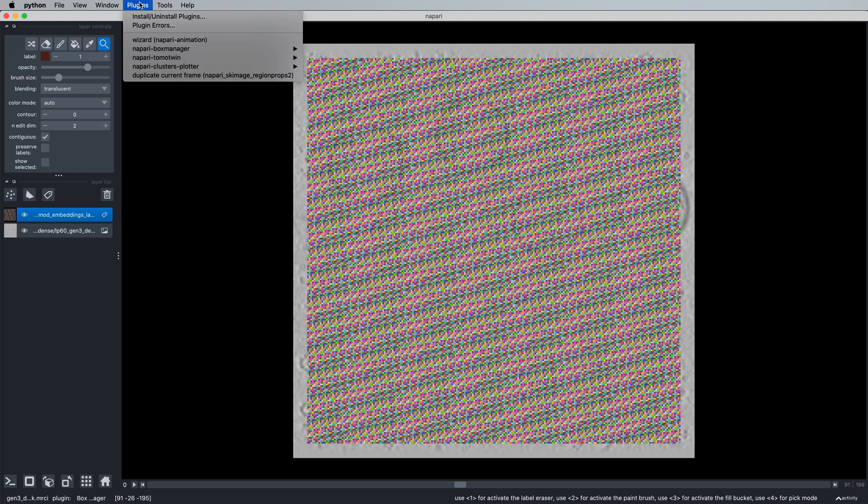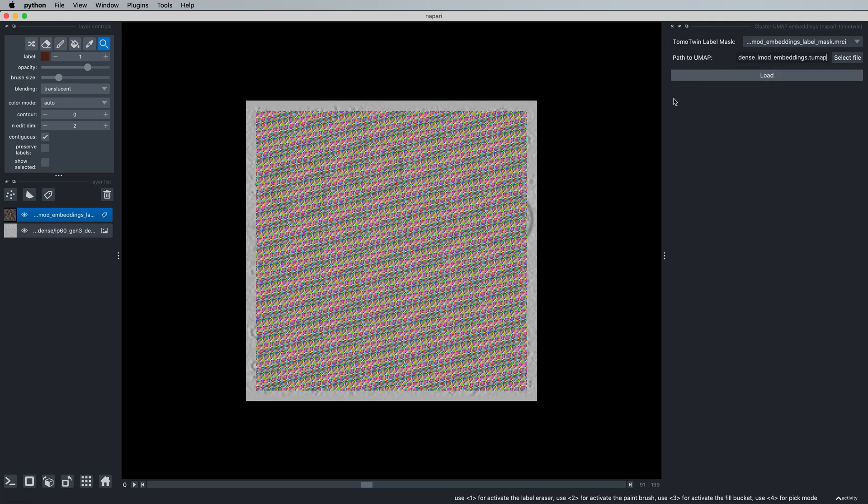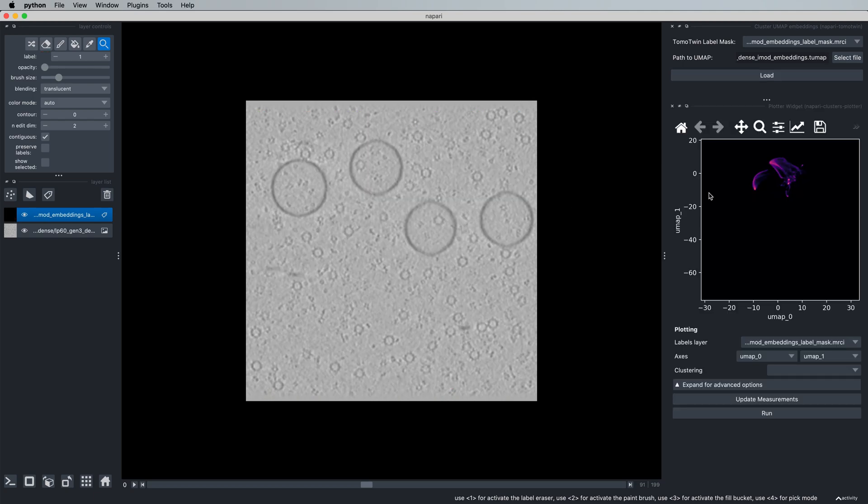To start the interactive workflow, come up here to Plugins and Napari TomoTwin and click on Cluster UMAP Embeddings. From here, we simply need to provide the path to our TomoTwin UMAP file for this tomogram. This is created with a simple script that essentially takes our 32-dimensional embeddings for the tomogram and approximates them in two dimensions so that we can directly interact with them here.